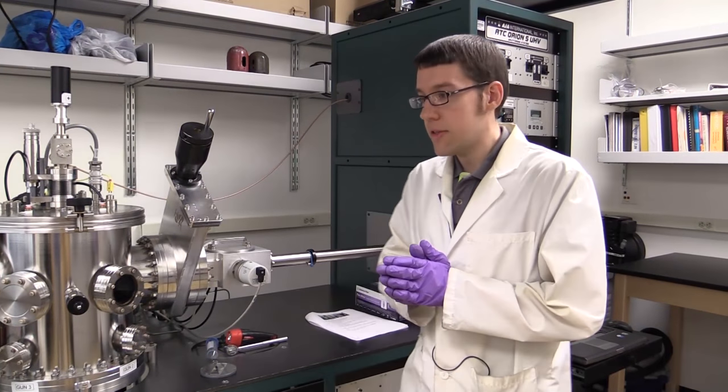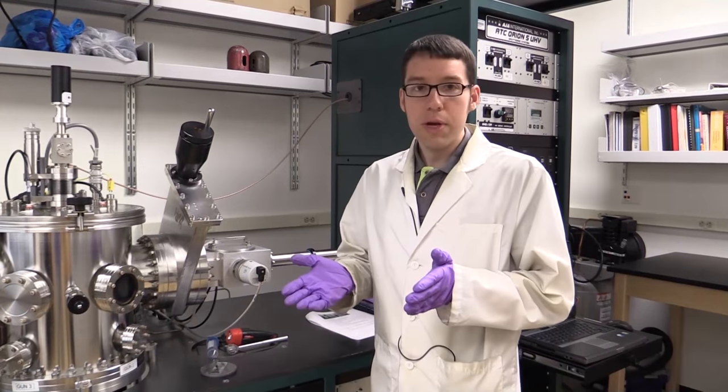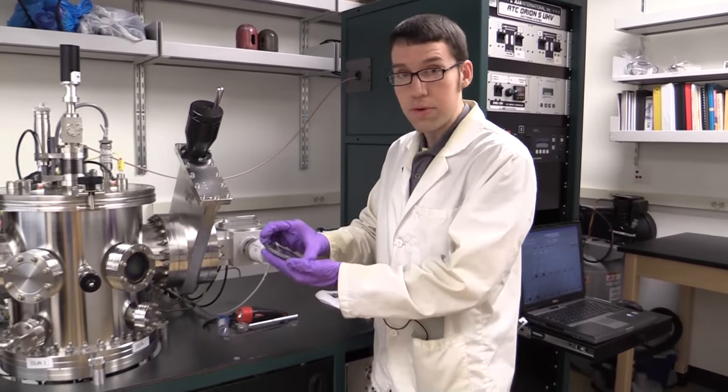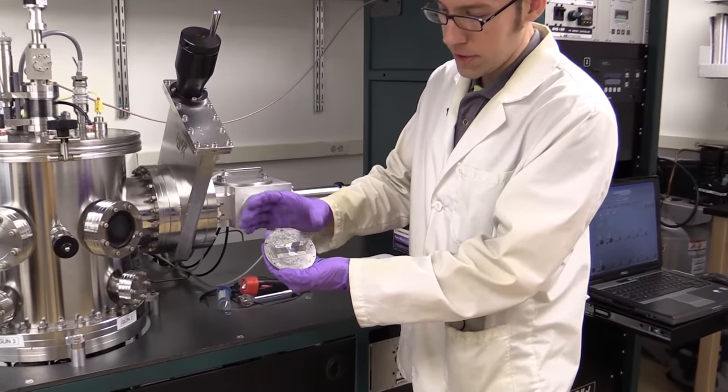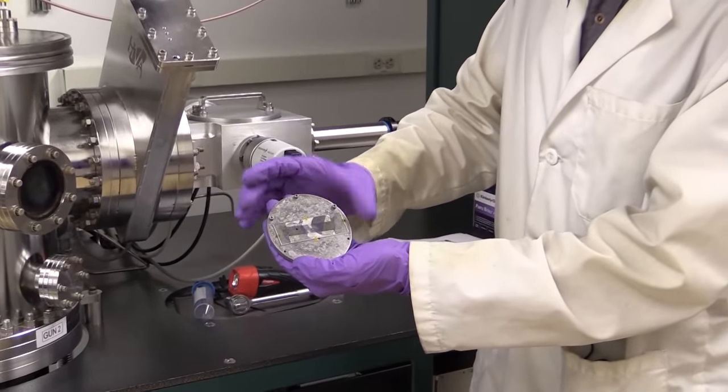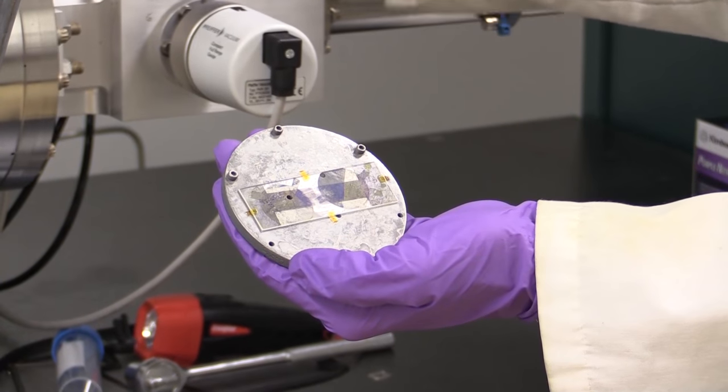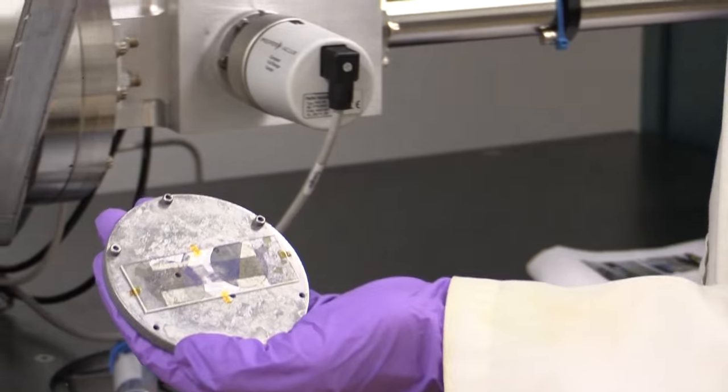So we'll get started with the sputtering process. The first thing we need to do for magnetron sputtering is clean a substrate and mount it on our substrate holder, which I've already done here for the purpose of saving time. Next, we'll load it in the load lock chamber and then move it to the main chamber where we do the deposition process.